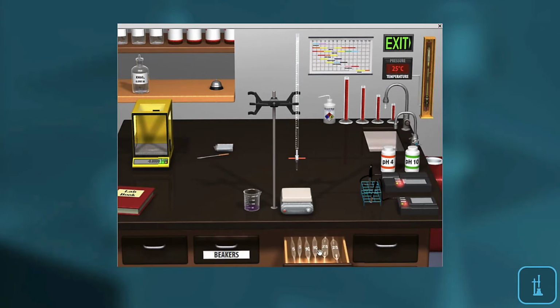Now, once you determine what size it is you need for your lab, there's two ways to go about bringing it over here. The first is just as simple as drag and drop. As you get closer to it, it's going to lock in, as you can kind of see here, and then once you let go, it's free. And then you can fill it up as needed.